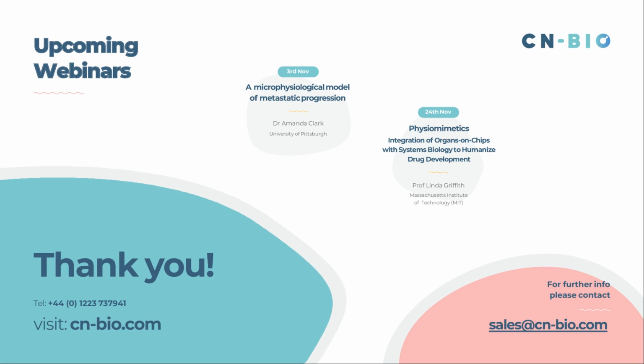Brilliant. And a question from one of our viewers is that they wanted to ask, how do you account for scaling of organs in multi-physiological systems, and do you have separate media for each cell type, or are they connected together with a common media, and how do you ensure that they all have their requirements met?